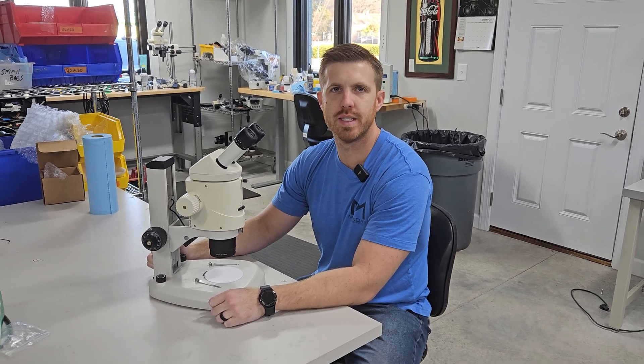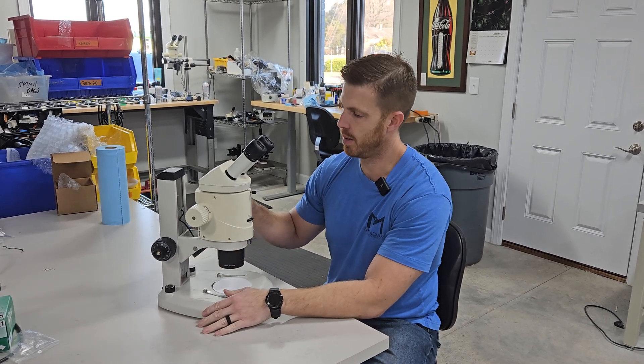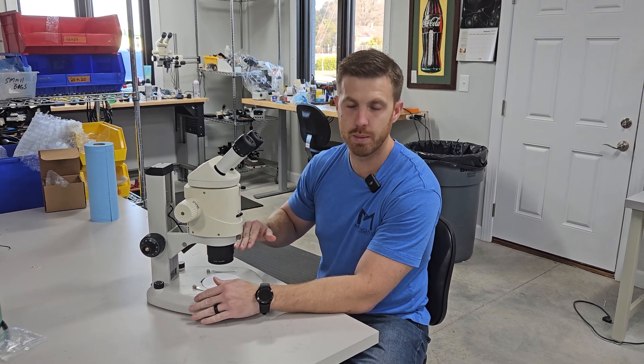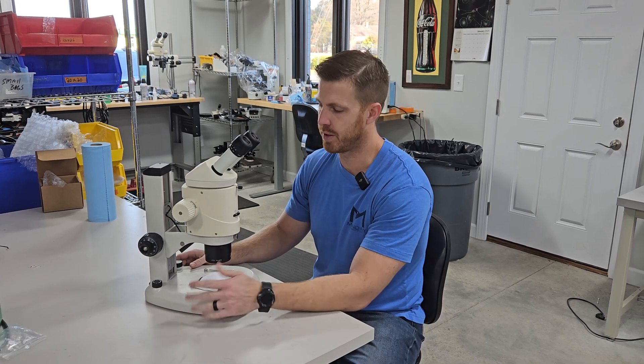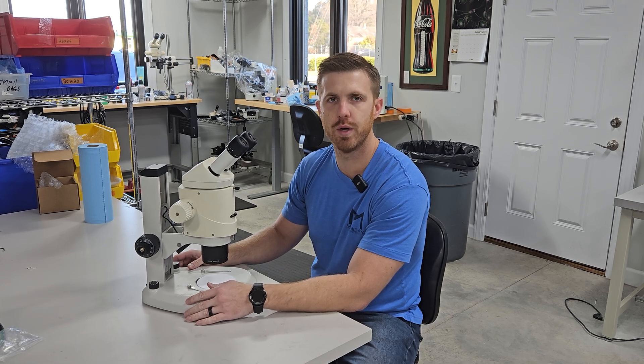Good morning, this is Chad with Monday Scientific. Today we're going to take this Leica MZ-16 and show you how to make sure everything's par focal whenever you're doing the zoom. A lot of folks will have problems with losing focus as they zoom in and out. It's a pretty easy procedure, but when I first started doing microscopes this is something I really struggled with, so we wanted to shoot a little video on how to do it.